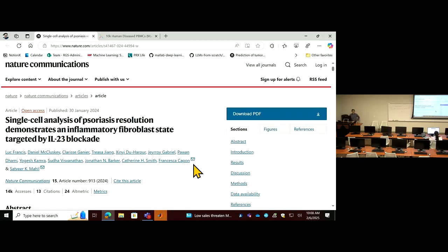While we are waiting for my computer to set up, spend some time to read through this paper very quickly and find the data set that we can download and play with. We are going to use this data set to see the basic QC we can conduct on this real data set, and some principles behind each step.